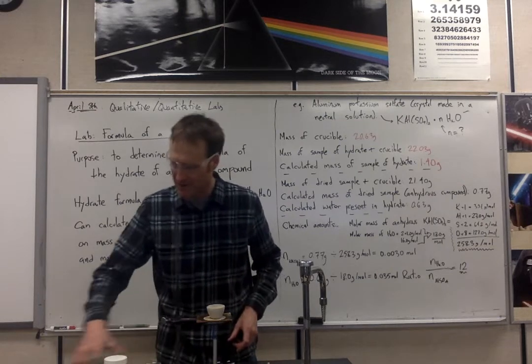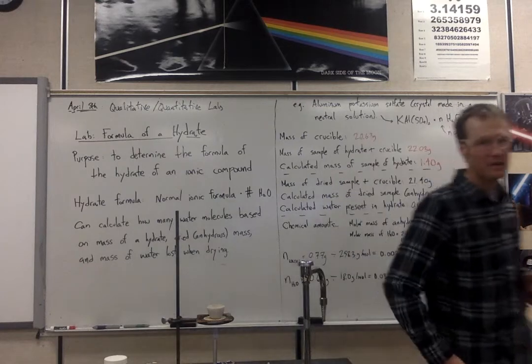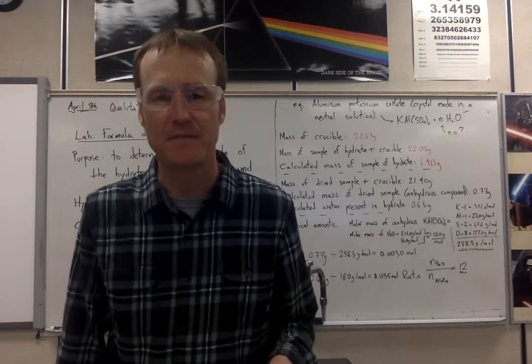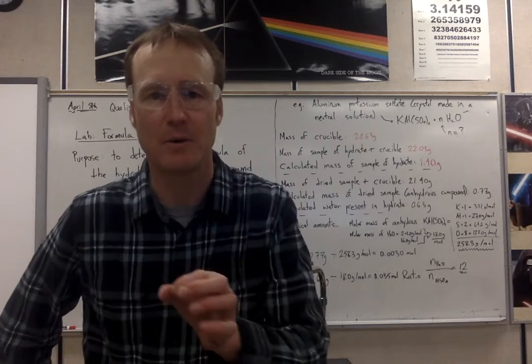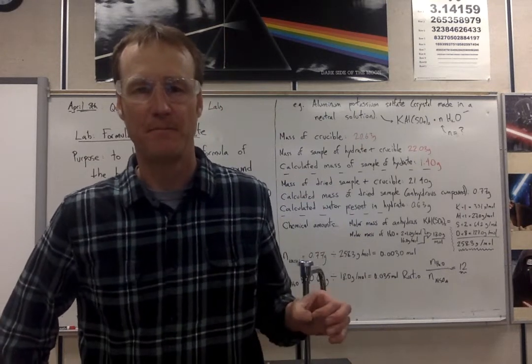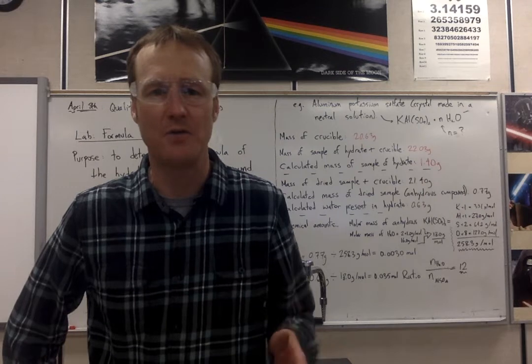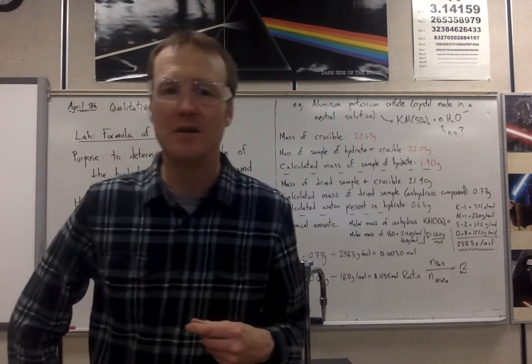So a reminder while this dries out: I'm going to measure the mass of the crucible. I'm going to put the crystal in. Then I'm going to measure the new mass. Then I'm going to put this whole contraption, the crucible with the crystal in it, onto the Bunsen burner. It's going to take a little while to boil off. You can just fast forward through the video while it's boiling off. Do whatever you want. Once we get to the end is when I'll have the results for you.